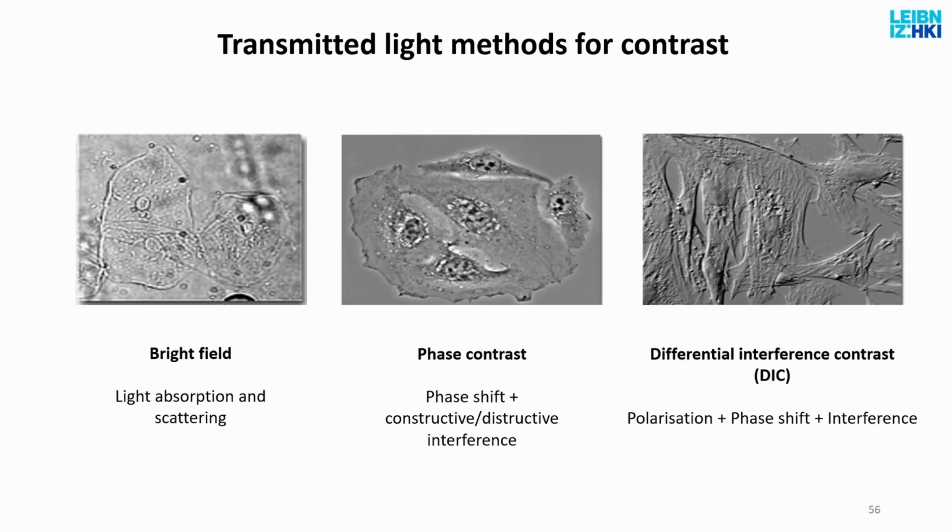The main modes you will work with are simply bright field, phase contrast, and DIC imaging. Again, these days we don't have time for that, we will go into this in the semester-long courses. In bright field, you simply take advantage of the fact that different parts of the tissue absorb different amounts of light. Bigger sample parts will be darker.